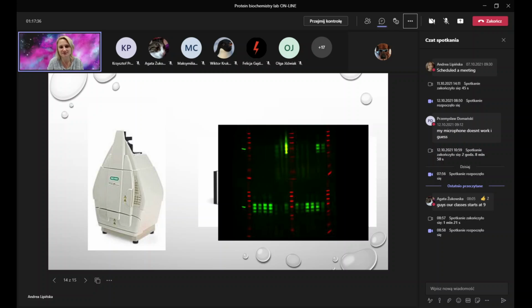So if we do this experiment properly, from A to Z, we would start from preparing competent bacterial cells. You can either buy competent cells or you make them competent yourself using various methods like the calcium chloride method, or there is the Rubidium chloride method that you can use. Generally, you need them competent, like for molecular cloning techniques. And then you transform them with a plasmid, pGEX in case of GST fusion proteins.